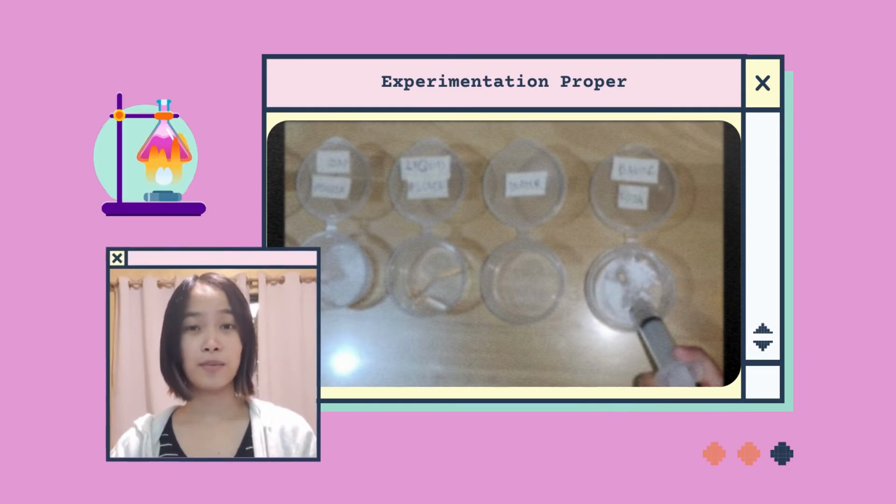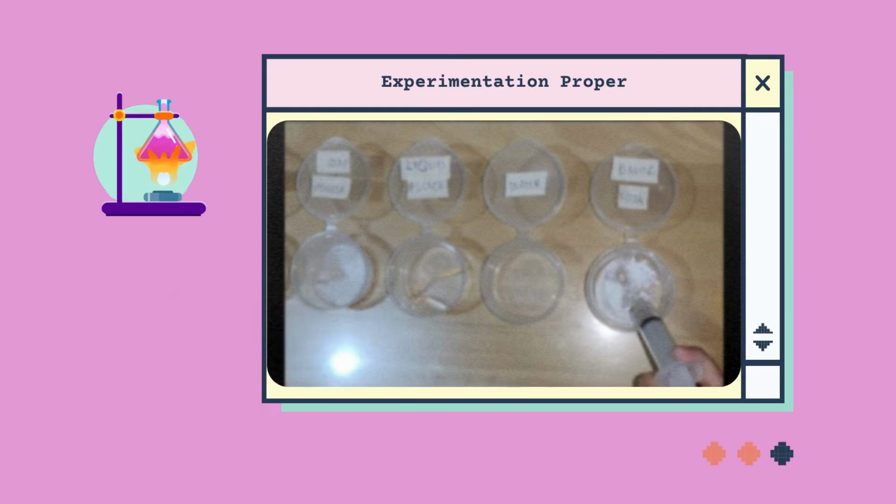Now, add 5 ml of water to each and mix it well.